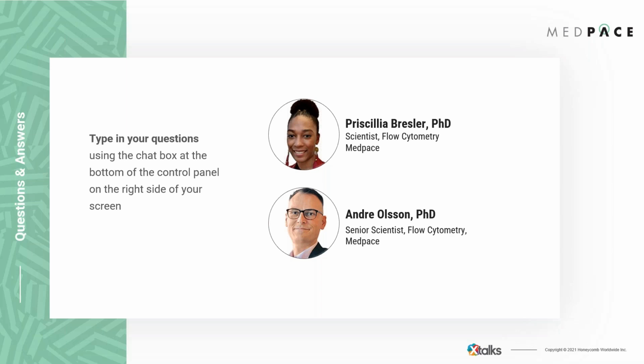Great, thank you, Priscilla. Our next question is, what is the benefit of measuring total receptor? I can comment on that. The total receptor is needed as a point of reference.